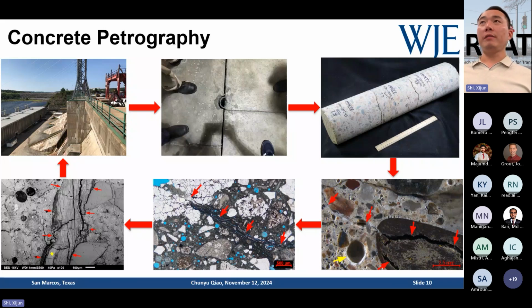So all this observation from the lab, from the eyes, from the microscope, from SEMs, we formulate reports, we formulate different detailed descriptions about the condition of concrete, feedback to the engineers. Let them better understand the current condition of the material or the ASR progress, and let them make decisions for future maintenance or plans for budgeting or whatever, that will work with the agency or the stakeholders.